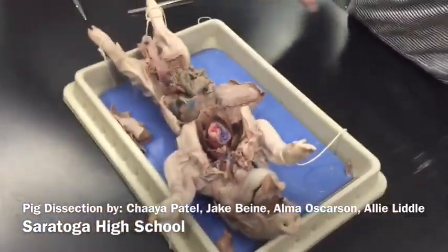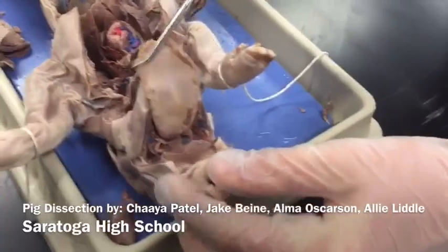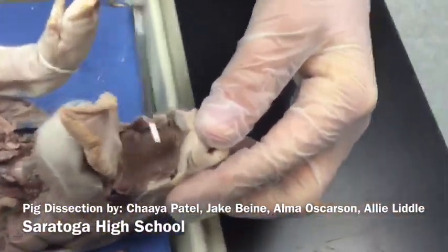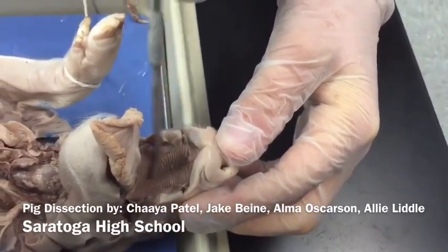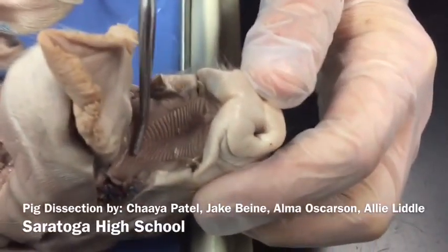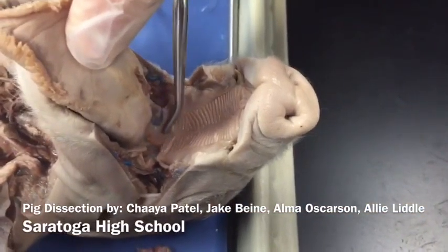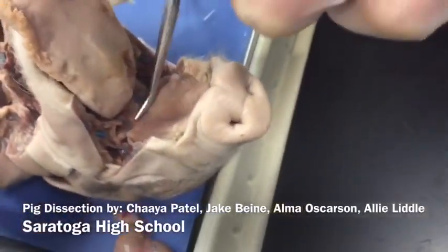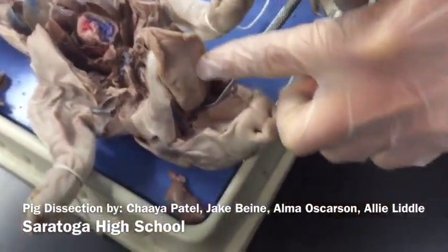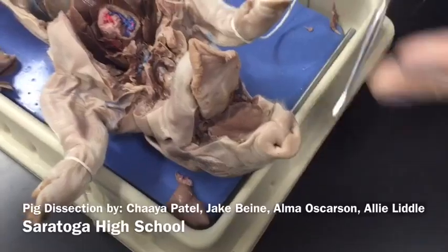Okay, and describe the mouth, the hard and soft palates. So when food gets put into the mouth, it rubs between the tongue and the hard palate, which is right here. You can feel the ridges on it. It helps break down the food, and then it moves to the soft palate, which is right here. This helps force it down through the throat, and the soft palate also prevents it from going into the nasal cavities. It just helps the food move down.